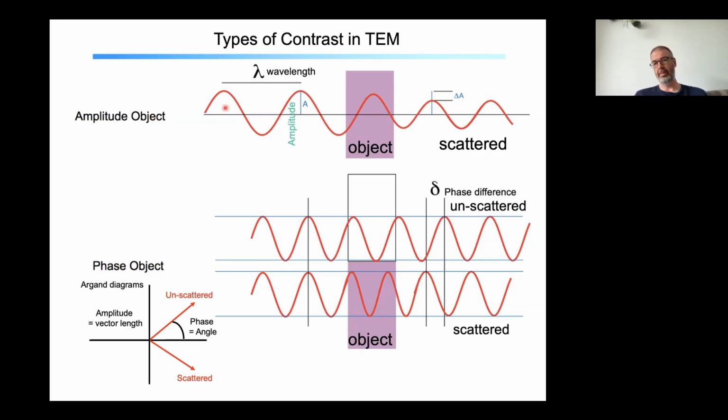The other thing I should note about this depiction is your wave has not only this amplitude value, but it also has a phase, so how many times it oscillates within 360 degrees. You also have a wavelength, which is the length it takes to go from positive peak to positive peak.